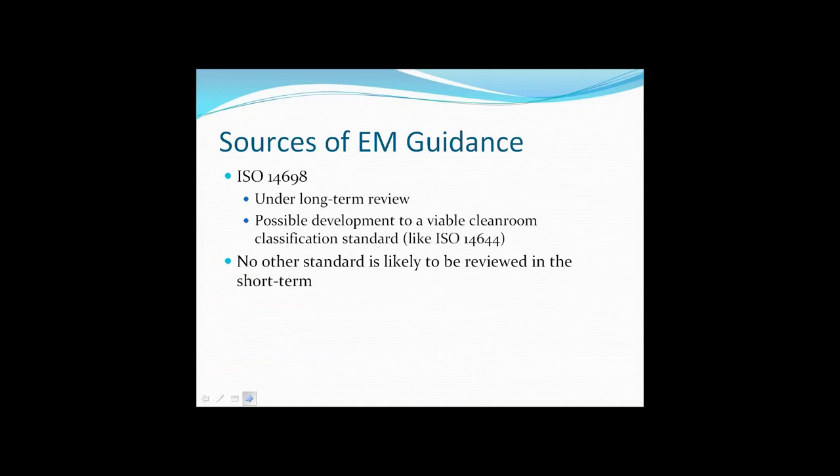Now, this standard is not that widely used, unlike its sister standard, ISO 14644. And this is probably because the ISO 14698 standard is not referred to in any regulatory guidance.